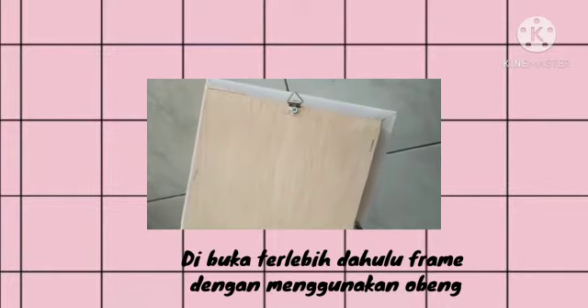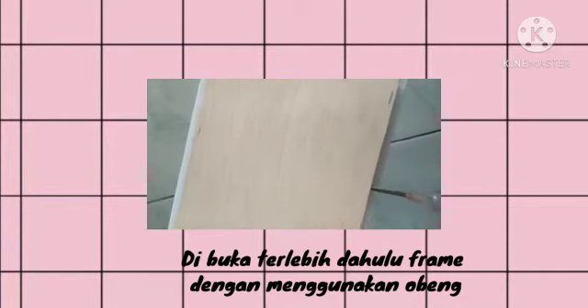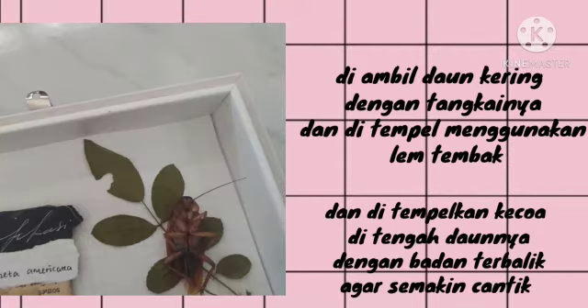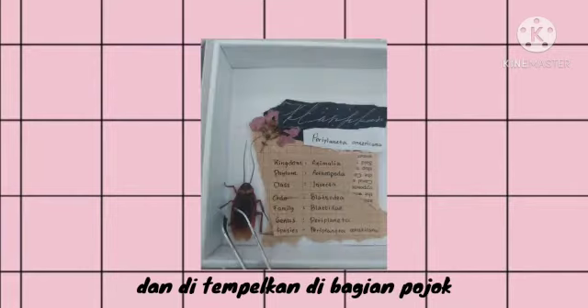First, open the frame using a screwdriver. Take pieces of used paper, torn randomly to look aesthetic, and write the classification on them. Take a dry leaf with its stem and attach it using the glue gun. Attach the cockroach on the leaf stem with its body upside down to make it look prettier. Attach another cockroach below the leaf stem in a tilted position, placed at the corner.